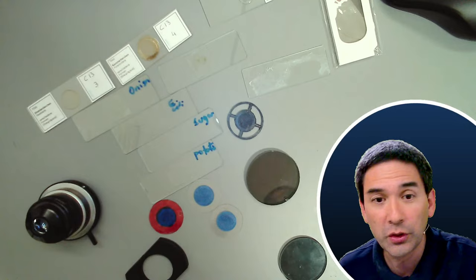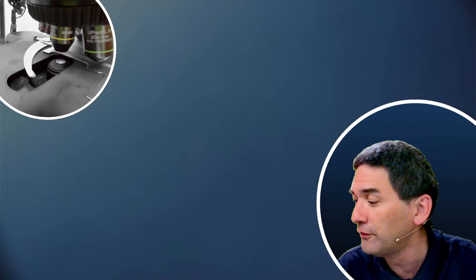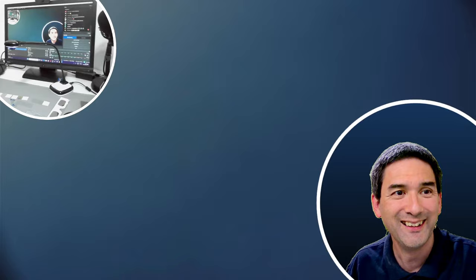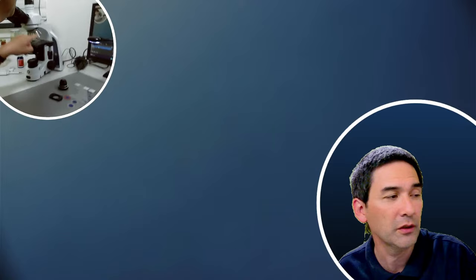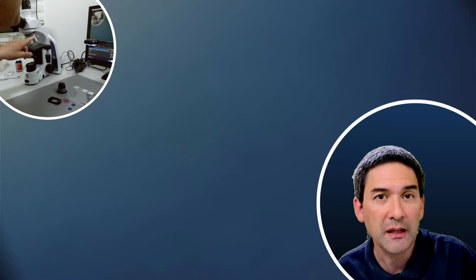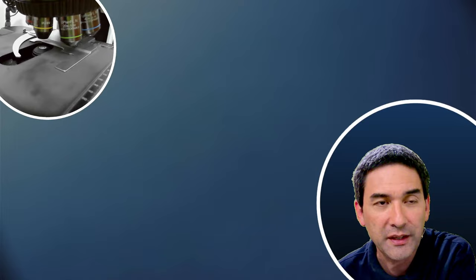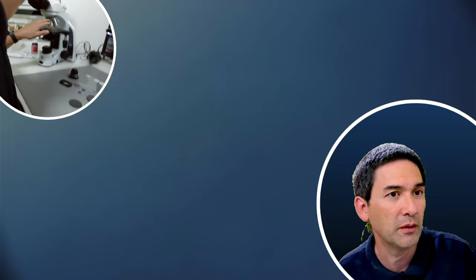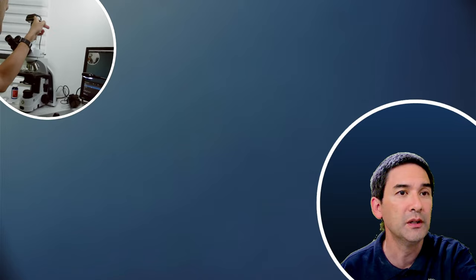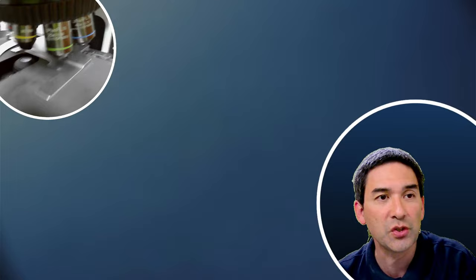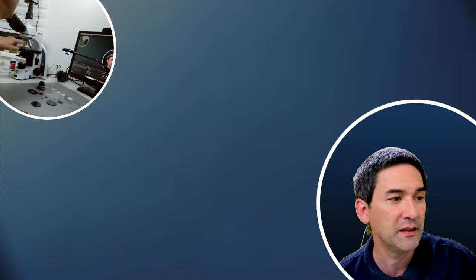First I want to give you a short view of my setup. I'm switching over to the microscope view. This is basically one microscope, but I've also set up another microscope here - a Euromax iScope. I'm going to use that one to demonstrate some contrasting techniques which my Olympus, that I normally use, is not able to do. It's also connected with a camera to the computer, so you understand what's going on.